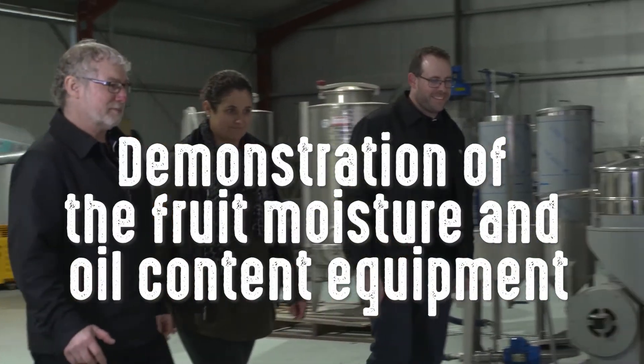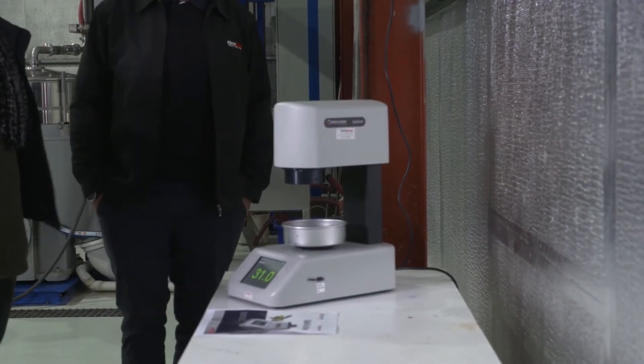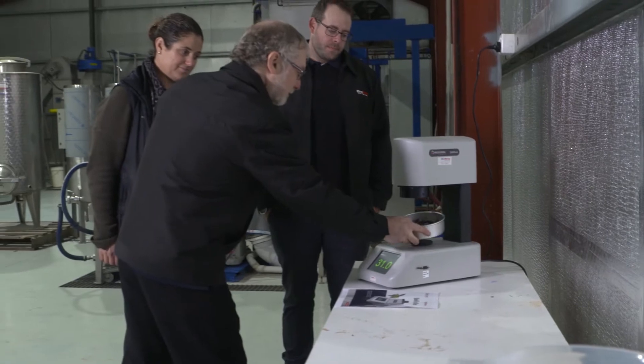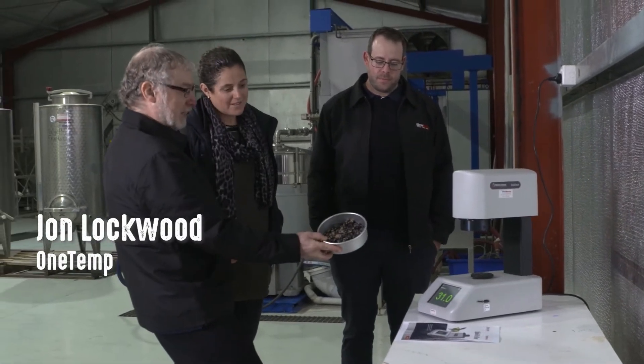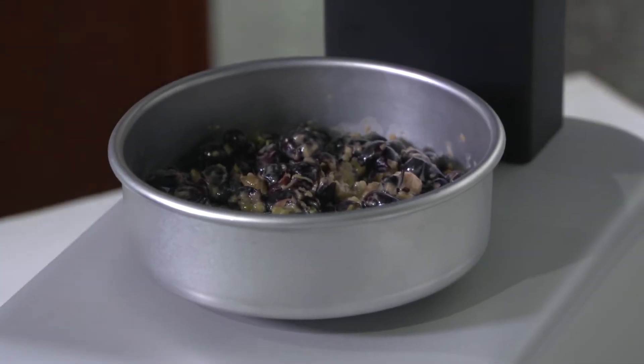I've got one other thing I'd like to show you. It's a little bit different than the weather station side of things. What this device will do is you get some graft olives which we prepared earlier, and what we're trying to pick up is the moisture content and also the oil and fat content of the olives.